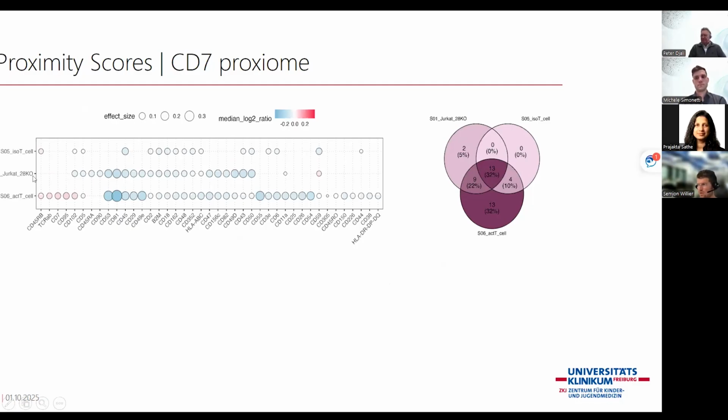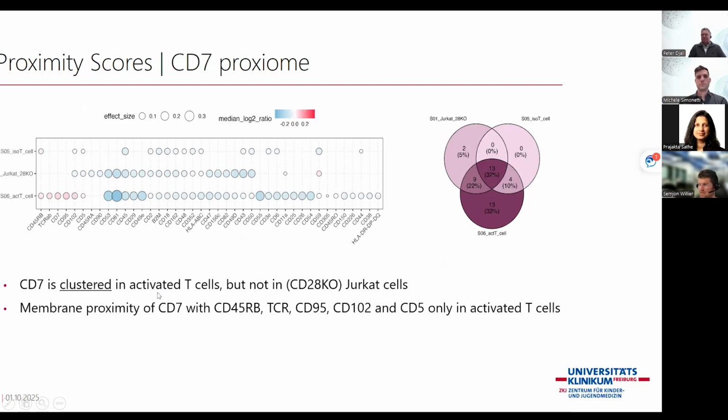You can also appreciate, if you look at this Venn diagram, that there are several features that are differentiating healthy, activated, and resting T cells from malignant T cells, which I'm not going to mention here, but which just illustrates the multitude of analyses and the detail that you can look at these cells with the Pixelgen data.